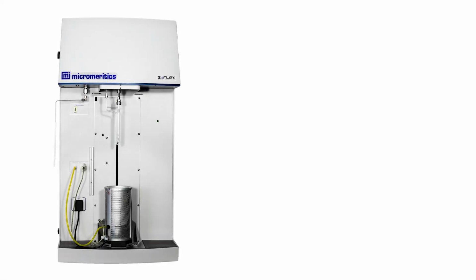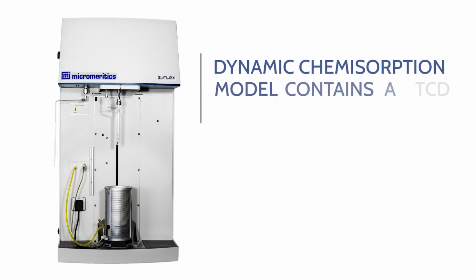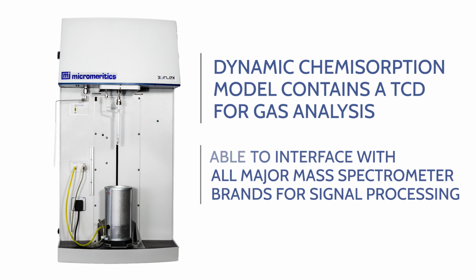The 3Flex is capable of performing both physisorption and chemisorption analysis. In this video, we're going to be looking at chemisorption. The 3Flex is capable of performing both static and dynamic chemisorption measurements depending on model. The dynamic chemisorption model contains a TCD for gas analysis and can also interface with all major mass spectrometer brands for further signal processing.